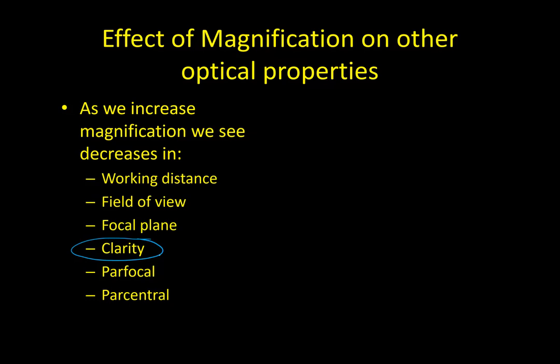Clarity. This kind of goes back to resolution. How clear is that image? Can you see details? If you have good clarity, you have good details. Okay? If you have poor clarity, then you're not really going to see anything except a big blob.